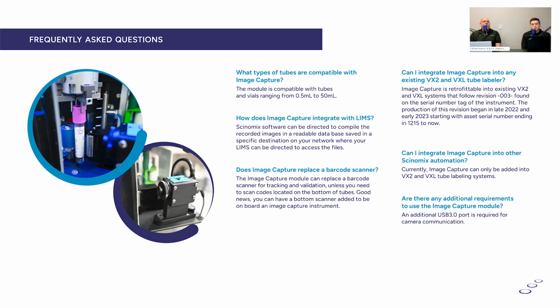We've gone through 3 revisions of the VX2, VXL tube and vial handlers, and the first revision is when we changed printers. So there was a printer that we initially had when we first started making these that is now discontinued. A lot of you that are on, if you have those older systems, we've been communicating with you over the last 2.5 years. We can't support those printers. The parts are gone after the end of this year. So we wouldn't upgrade those systems.